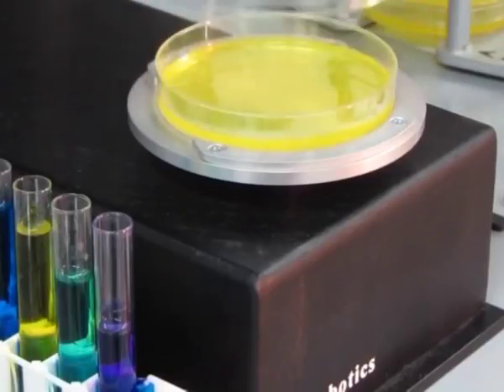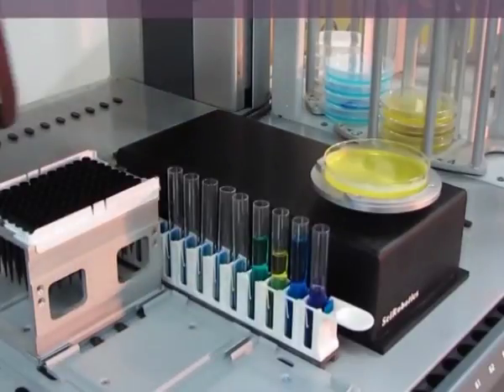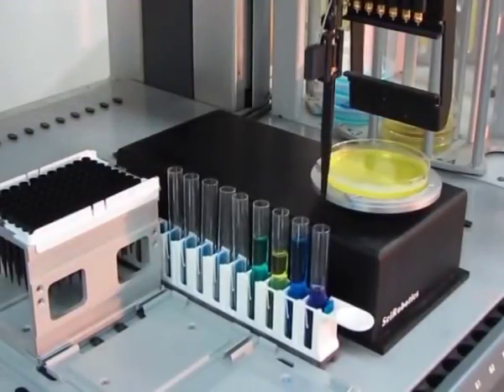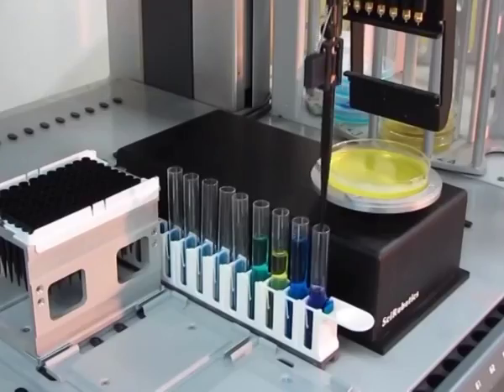Following growth, the colonies are enumerated. Alternatively, a DMC can be made. In this case, the organisms collected on the membrane are viewed and counted microscopically following the appropriate staining, washing and treatment of the membrane to render it transparent.